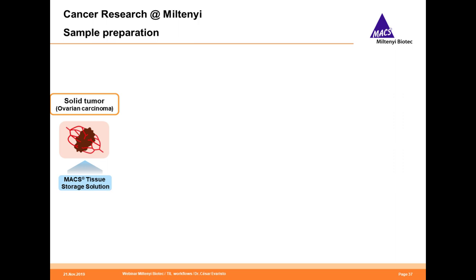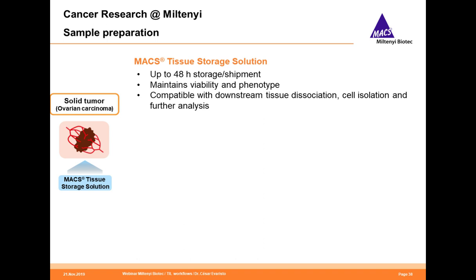In this particular experiment, we were contacted in the middle of the afternoon with information that an ovarian carcinoma sample had been resected from a patient. The tumor sample was stored in MACS Tissue Storage Solution and shipped to us overnight.